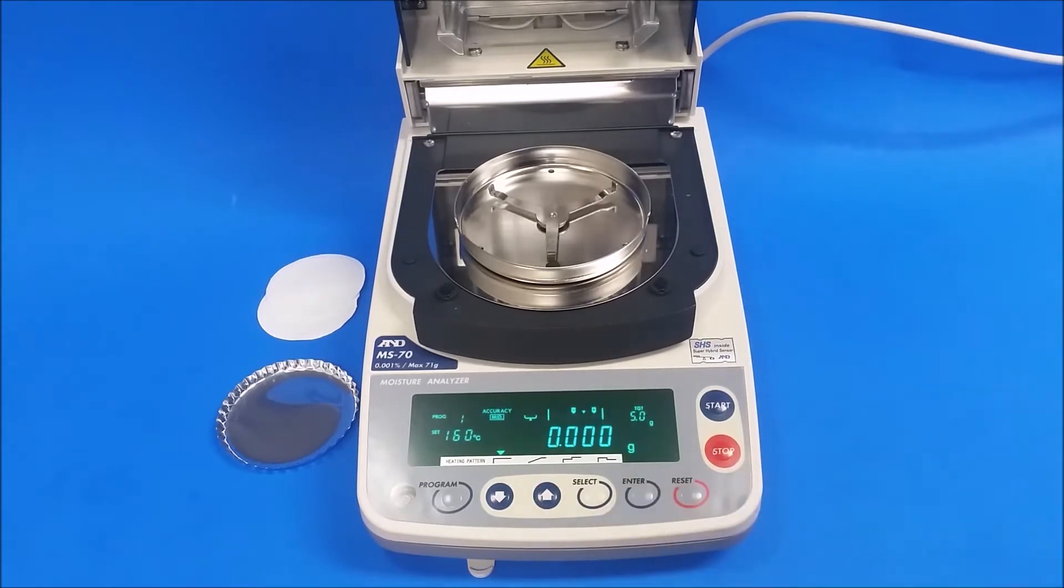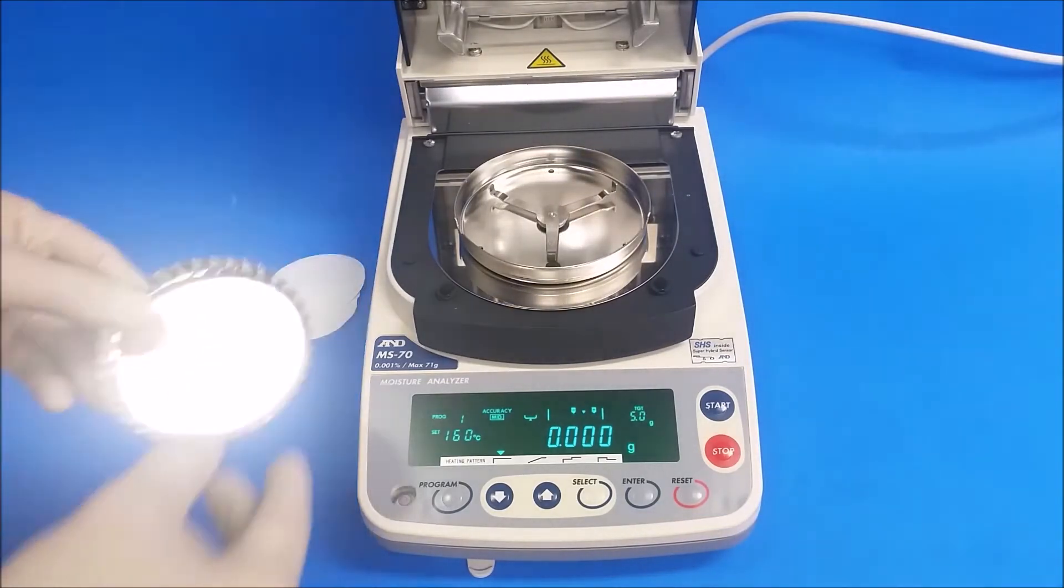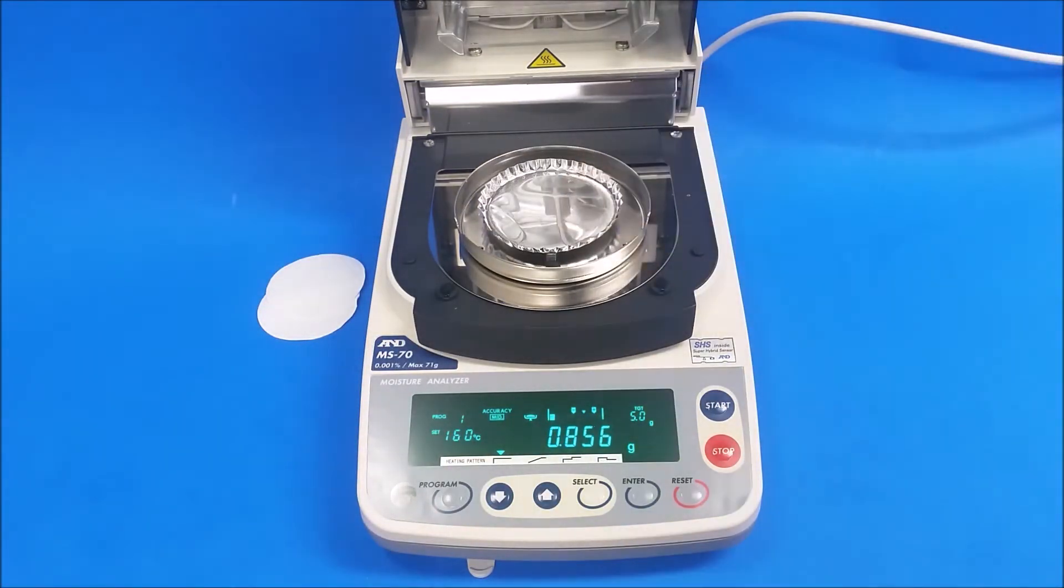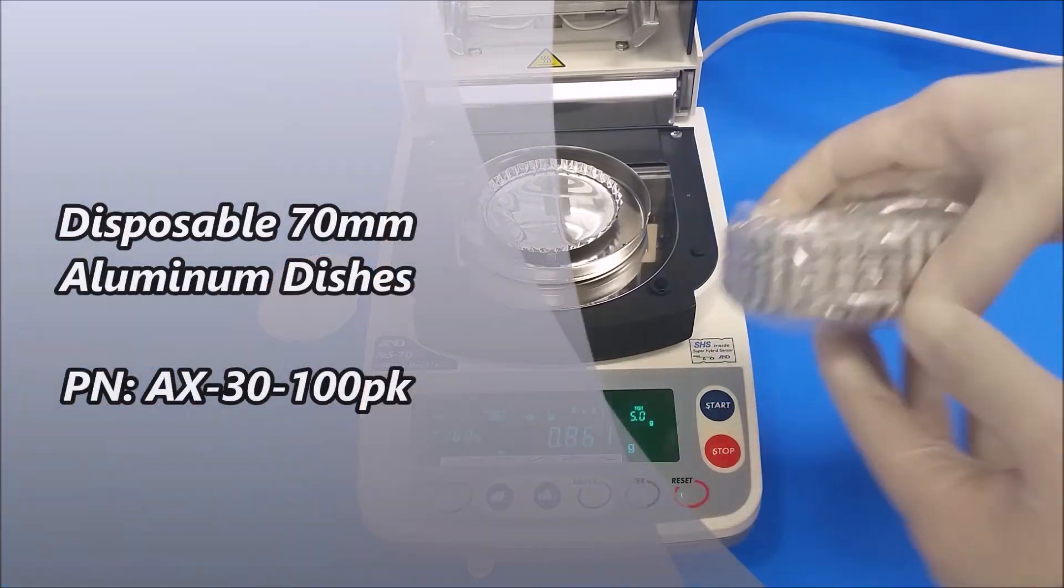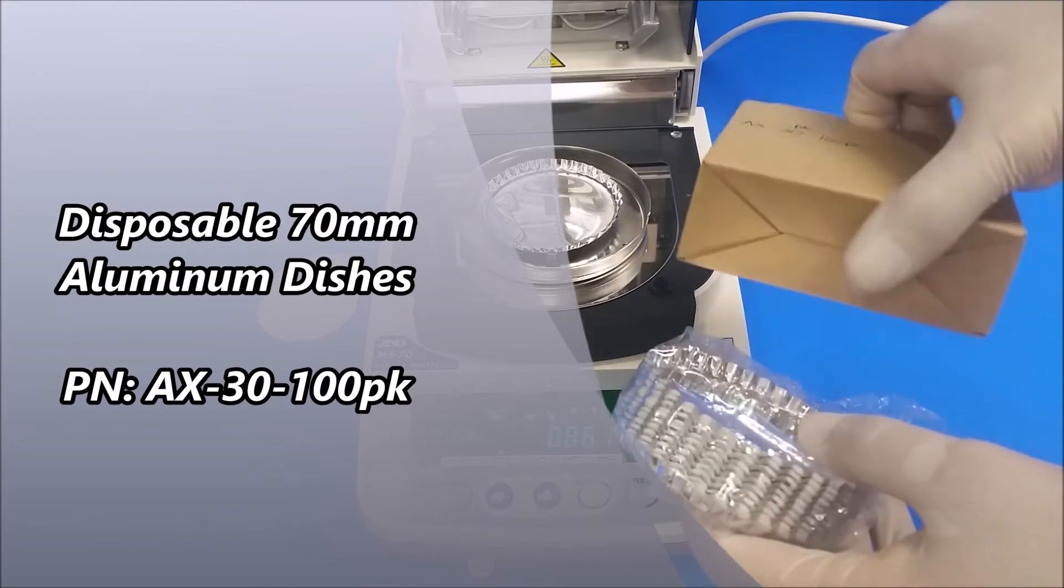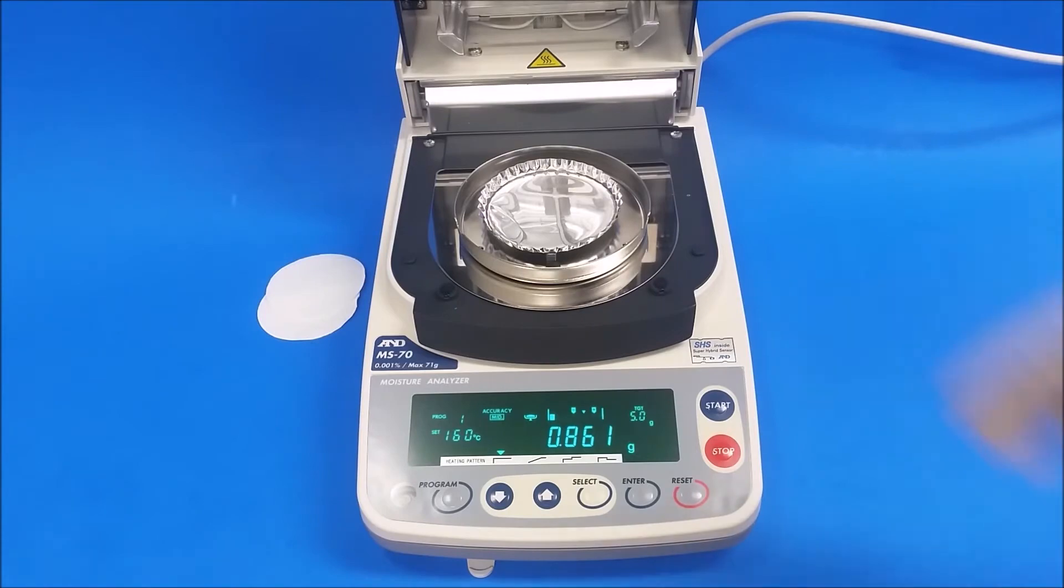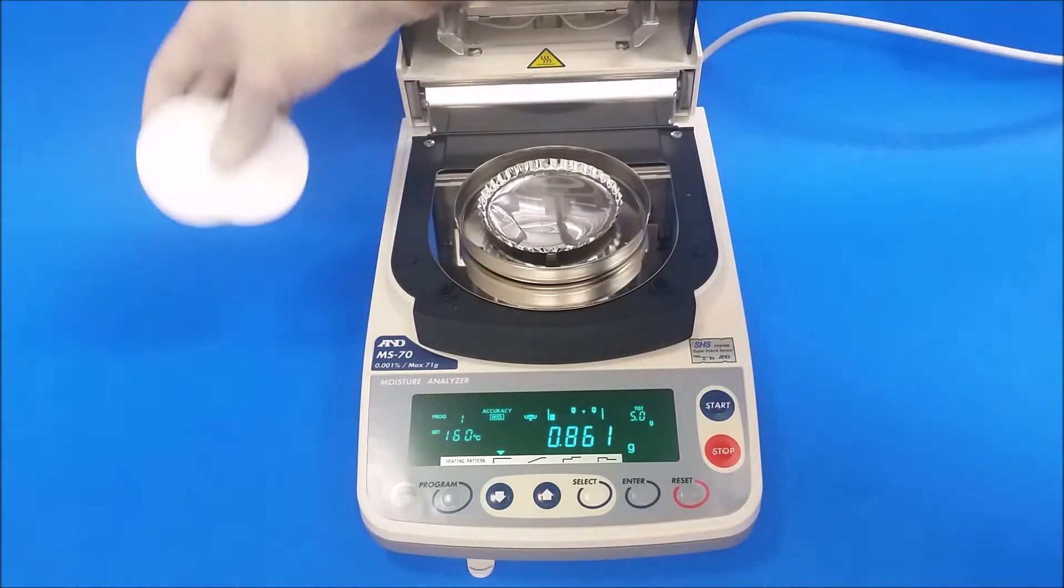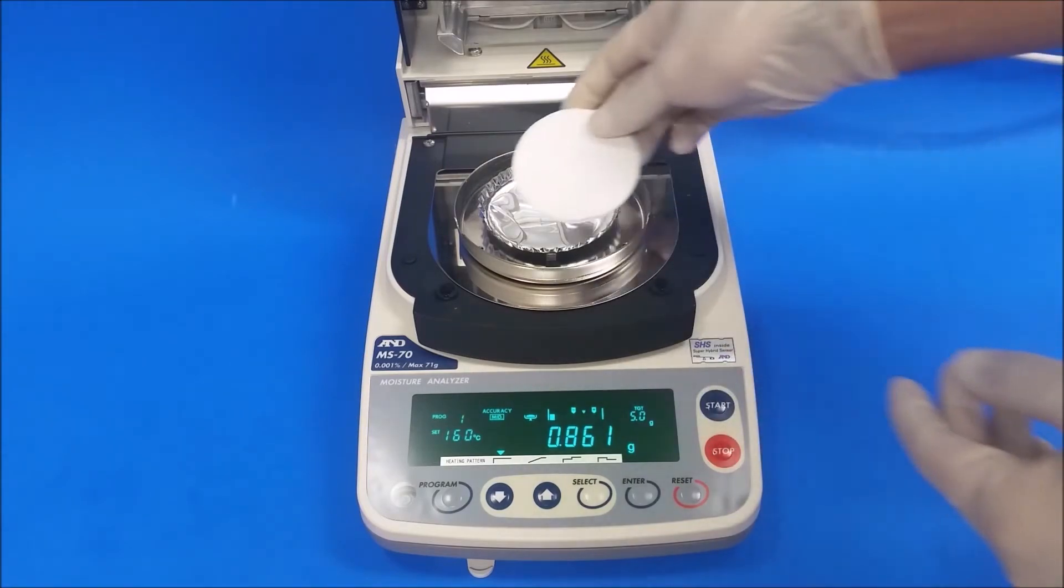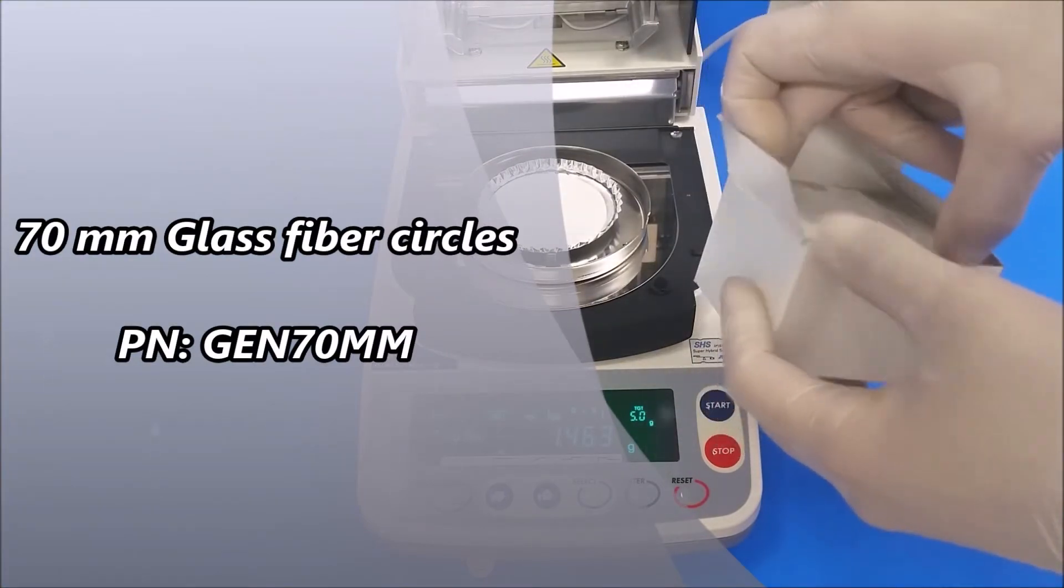Next I'm gonna put the aluminum dish. Those come in a pack of hundreds and they should look something like this. They come in a little brown box. Next I'm gonna put my two fiberglass pads. Those we also have. They come in a white glossy box, pack of hundreds.